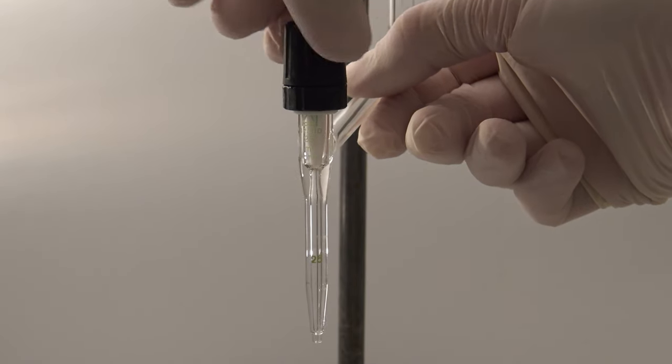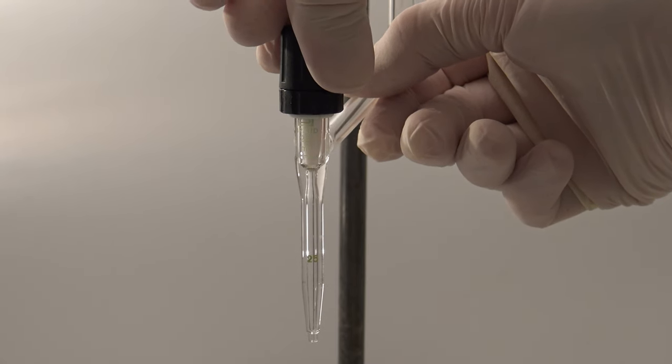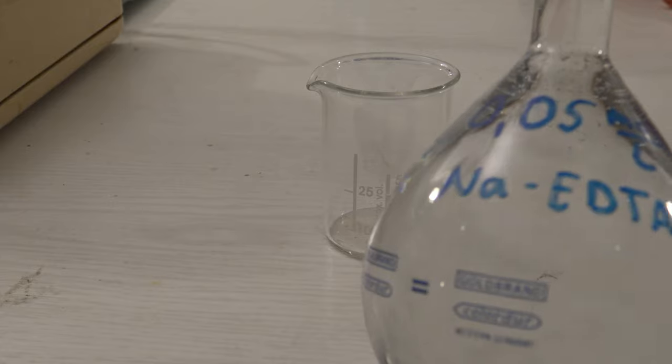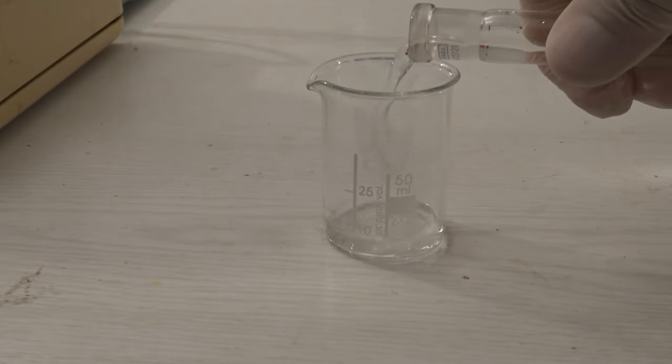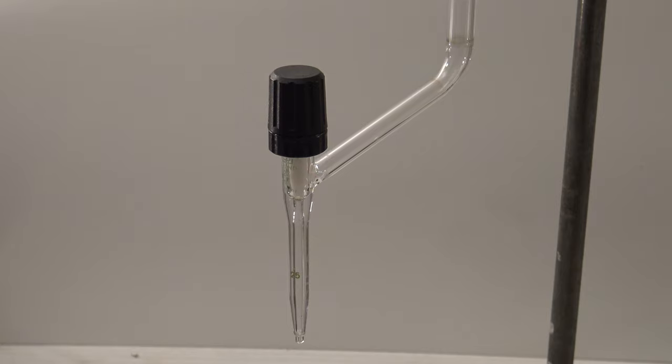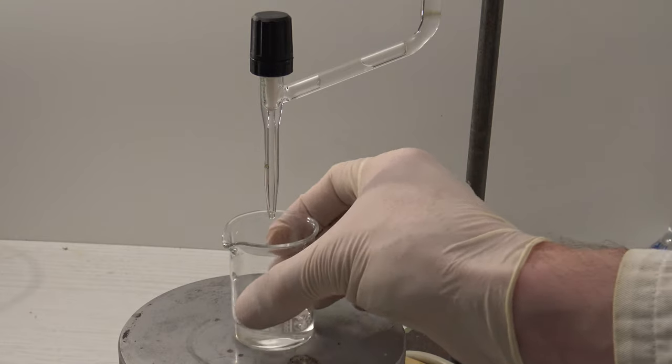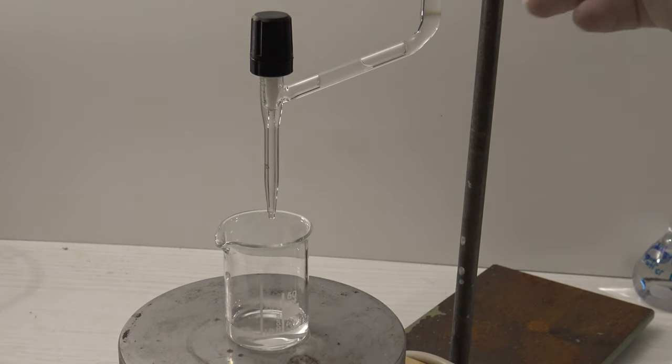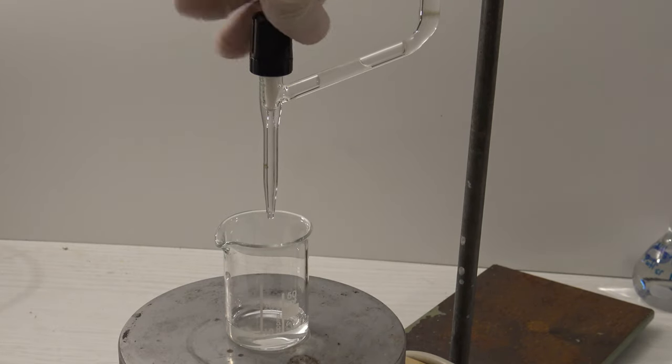Before filling the burette, it has to be made sure that the stopcock is closed. Then it can be filled with the EDTA solution. At first, bubbles of air are trapped inside, which is why the burette is filled above the highest marking. To remove them, the stopcock is opened somewhat quickly and the excess solution is collected.